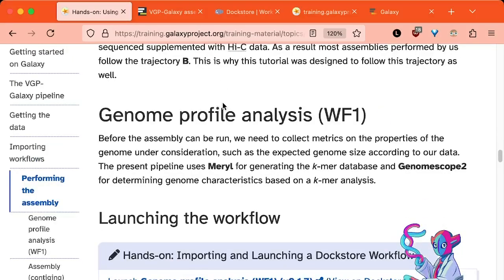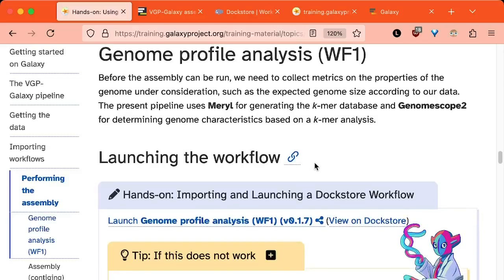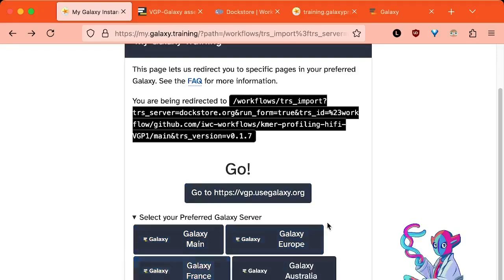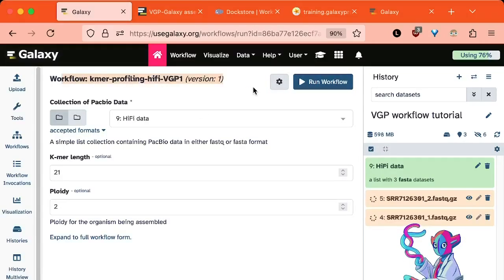When you reach a specific workflow section in the tutorial, you'll find a 'launching the workflow' section where you can click the link, select your preferred Galaxy server — for example, Galaxy main — and it'll load the workflow and put you into the submission form ready to go. We can start workflow 1 now since we already have our collection of PacBio data ready.